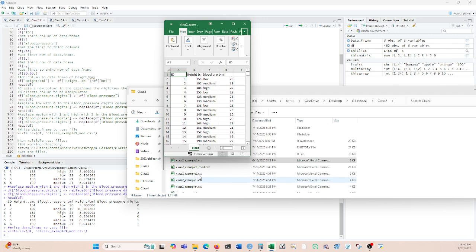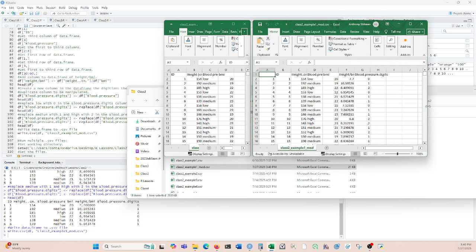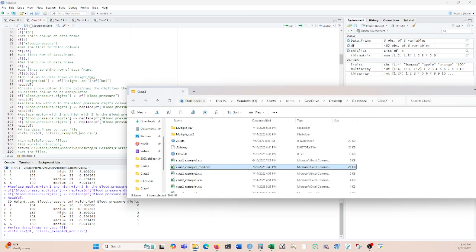And let's look at its offspring. You can see here that the new columns are now added to the original data when you export it. I suggest that when you do this, you name it something like modified or version, so you don't overwrite the original piece of data. You don't want to lose data ever. You've got to hoard that stuff. You don't want to accidentally erase it, realize you've done something wrong, and then have lost the original piece of data. So always name it something different.